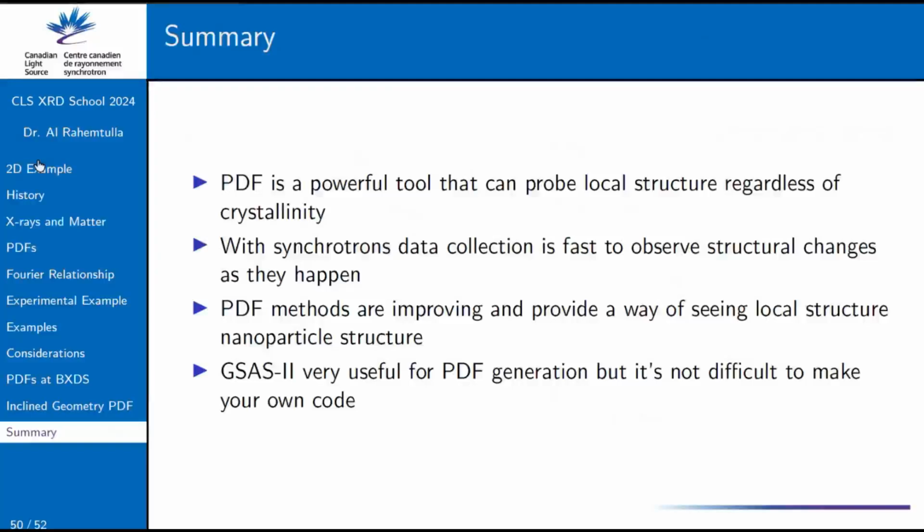But I have the math here that goes into everything that we did. And while I wouldn't call it trivial, it's something that even with a little bit of coding background, you can do yourself. My advice is, if you are interested in PDFs and understanding them, I wouldn't necessarily use it to publish your own data right off the bat. It's a fun exercise to try to follow along with your own code to make a PDF. And the nice thing about going through it step by step, similar to how we went through in this presentation, is you can start taking away little subtleties of what steps are doing what.